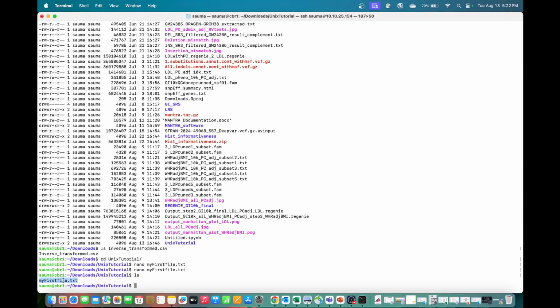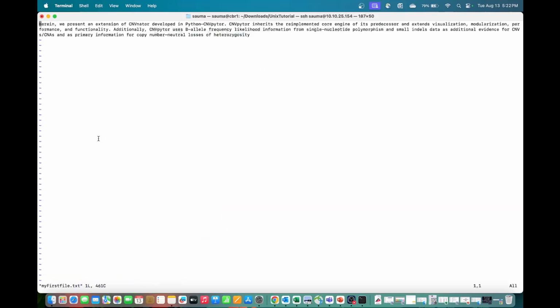So Vim is something that is used when you are creating a file, but it can also help you see the file as well. So say for example, I want to see the file. I do a vim space the file name. See, I can see the file here. I can read the file here. The whole file, all the text, is here.